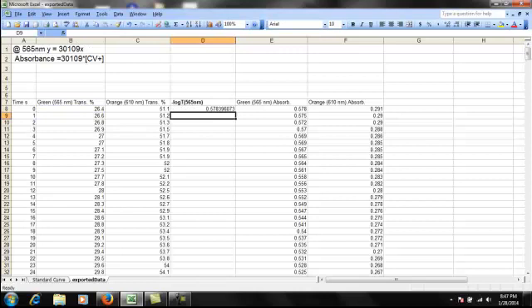That is the same thing there as my absorbance. Now, even cooler, I would have to do that for every data point, right? Which is long and tedious and terrible, but there's this option, okay?